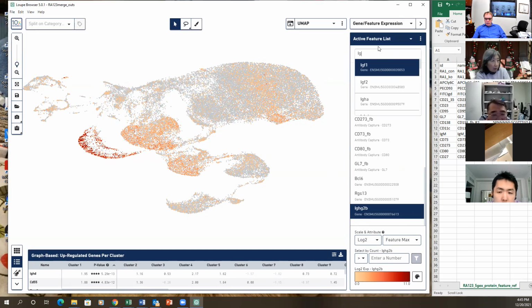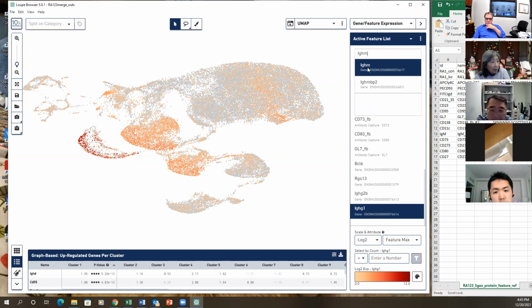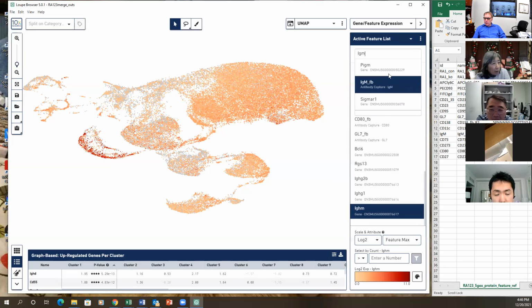How about G1? Yeah, it's all the same. So this is a non-germinal center antibody. What about IgD? How about IgD? We have antibody for IgM too. But yeah, what about the antibody for IgD? See if that works. There's so many. Yeah. It seems like it's a little stronger in that little dimple. And I see some IgM strong.